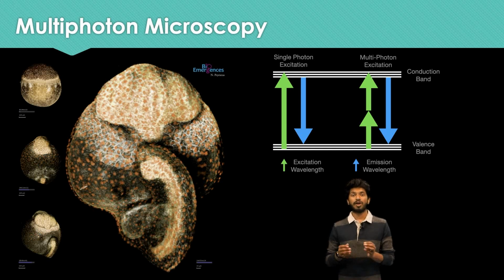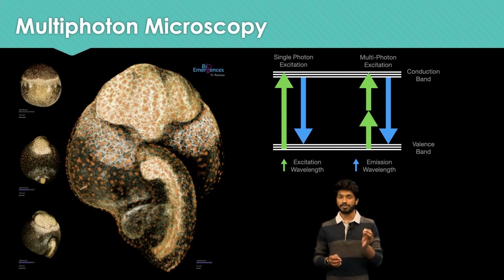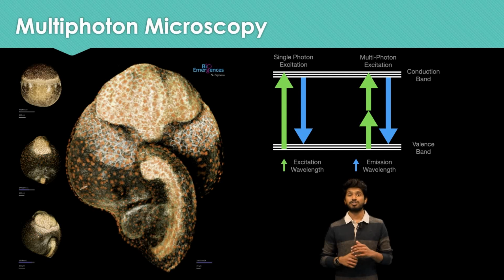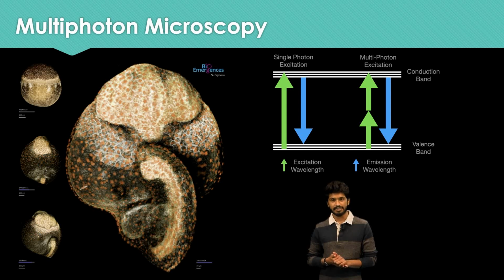Multiphoton microscopy also has a specific advantage of being able to image specific cellular components like collagen and myosin by using the principle of second harmonic generation or third harmonic generation. This is due to the structure of the protein reflecting the excitation wavelength at half of its original wavelength. Multiphoton microscopy can be performed as 2-photon microscopy or 3-photon microscopy, limited by the excitation wavelength of the laser and the detection capabilities of the detectors.